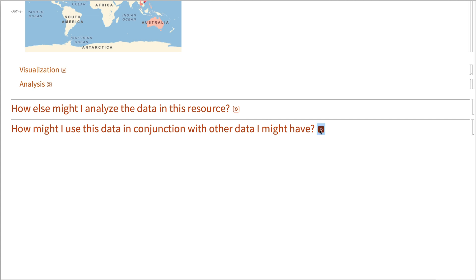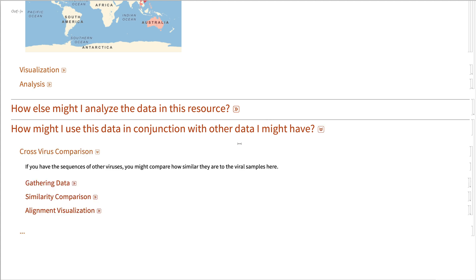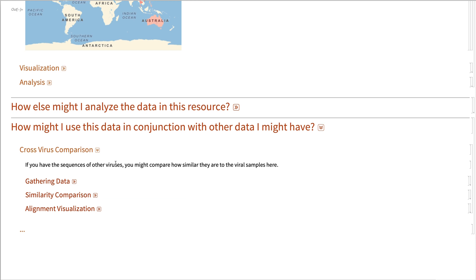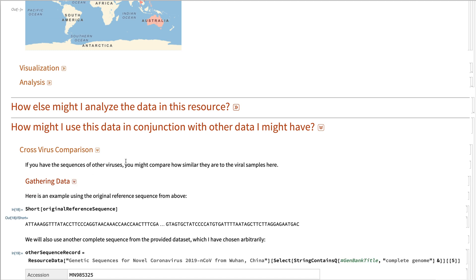This data is also very nice to use in conjunction with other data that you might have. For example, I'll show you here how to do some, if you have sequences of other viruses you're interested in, you could compare how similar they are to the samples here.